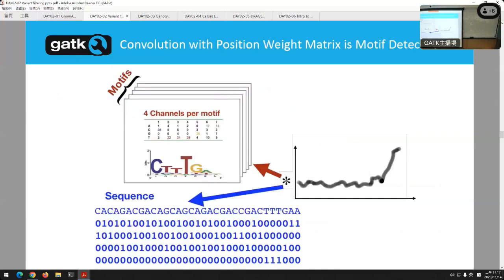And you can do that many, many times, over and over again. We do something called convolution. Convolution is a mathematical term which means a blend. A convolution is a blending of different functions. So we're basically taking those motifs. Again, this is very high level. This is fun deep learning. You blend these things across many thousands of motifs. You're trying to have the computer learn a model of what happens in the genome.